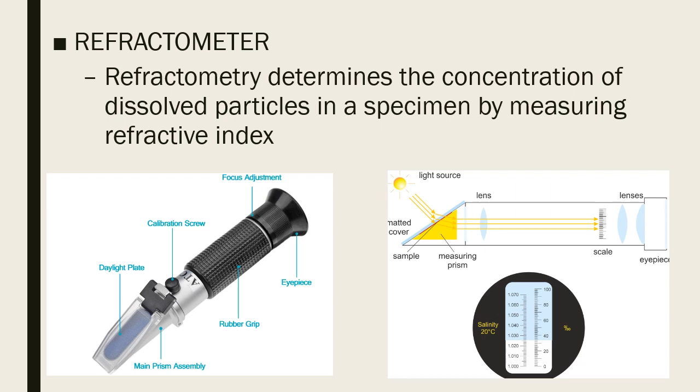But be careful, because other refractometers have serum specific gravity scales. So you check the label if you're using the scale for urine or for serum. Others also have graduations at 0, 5, 10.